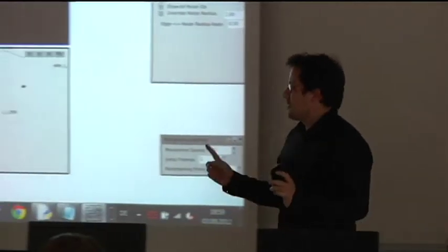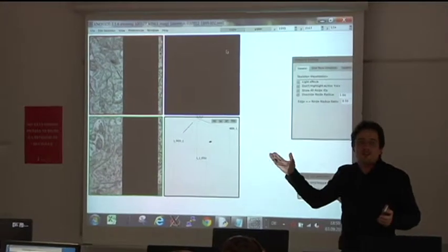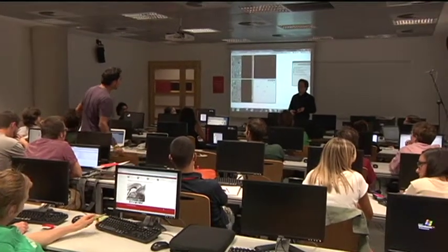So the reference is 1 minute 50 for that particular axon. So I'm now going to reposition you on that axon. Who wants to take up the challenge? First of all, bravo. I mean, this is really a 30-second tutorial on how to fly through the brain, and you got it. Very good. So I'm pretty sure the organizers will have a present for you or something like that.